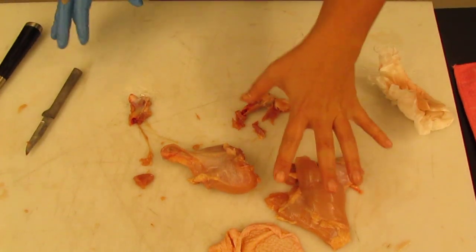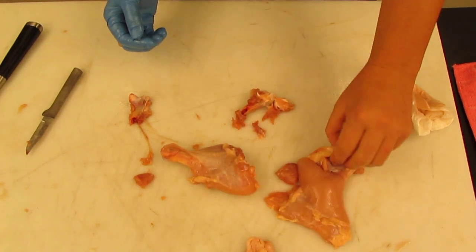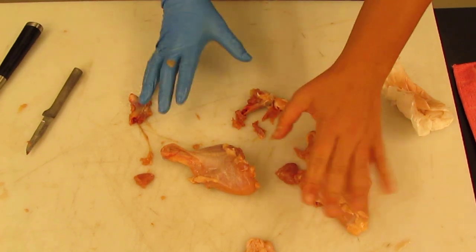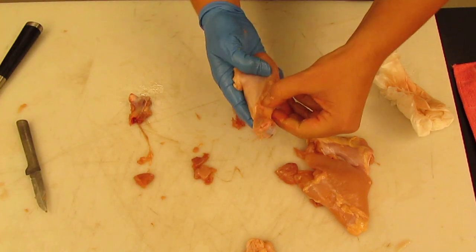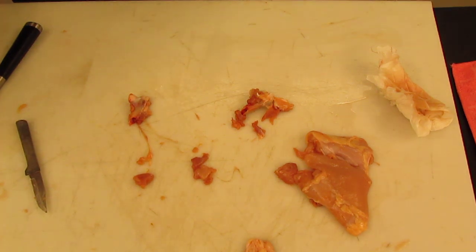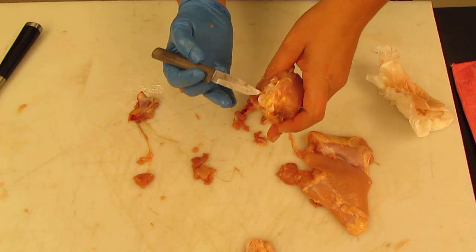Okay, so once again, I would like you to identify things like the skin, the integumentary system, the slimy fascia that connects it to the muscle, loose adipose connective tissue, a series of muscles on the thigh as well as the gastrocnemius, tendons, which I'll show you again, there was a question about that. So here, a white shiny tendon right at the surface of the leg. You should look inside the hinge joint, the knee joint, for the menisci. This right here is a meniscus, and the ACL, which I cut through.